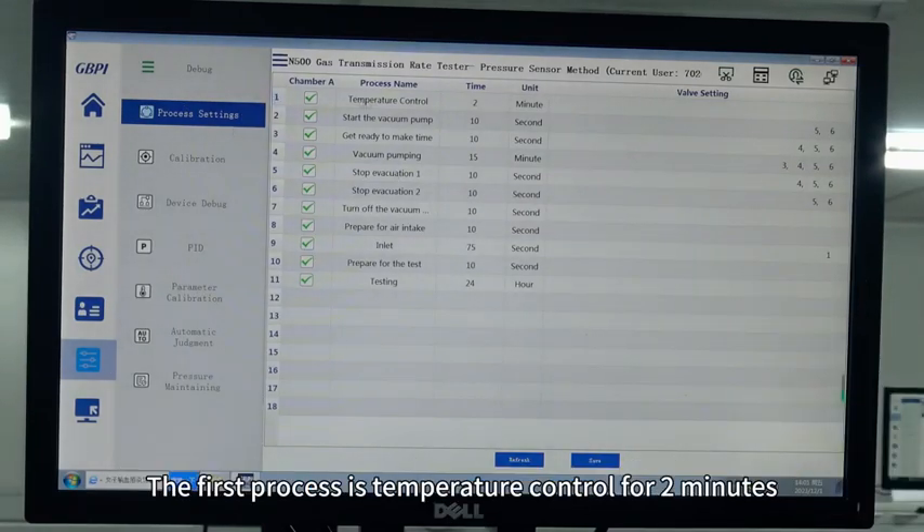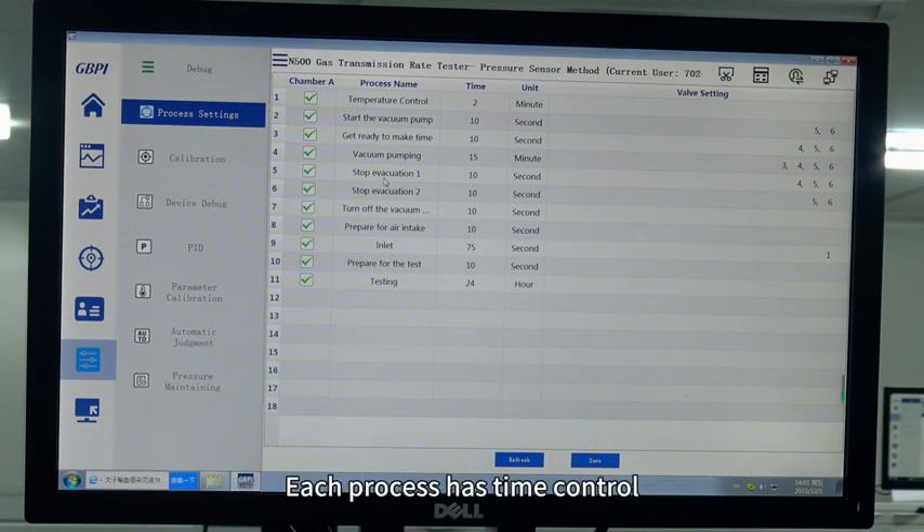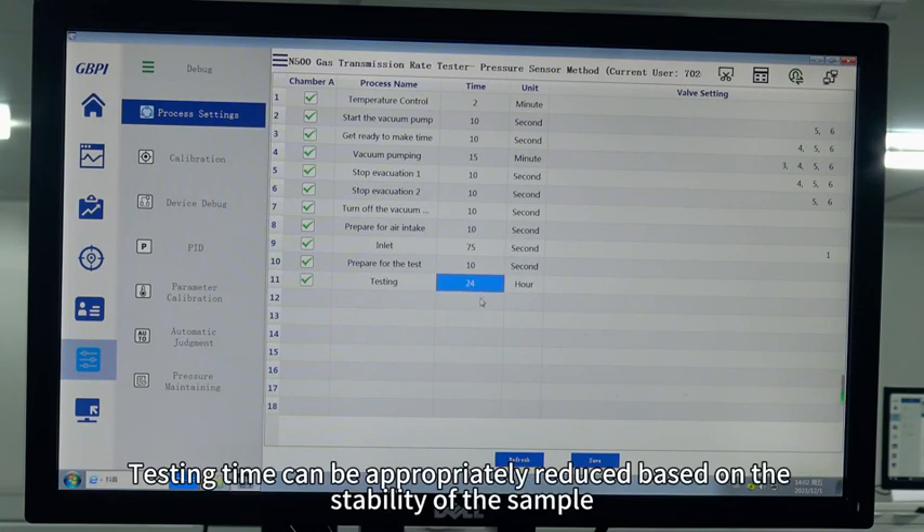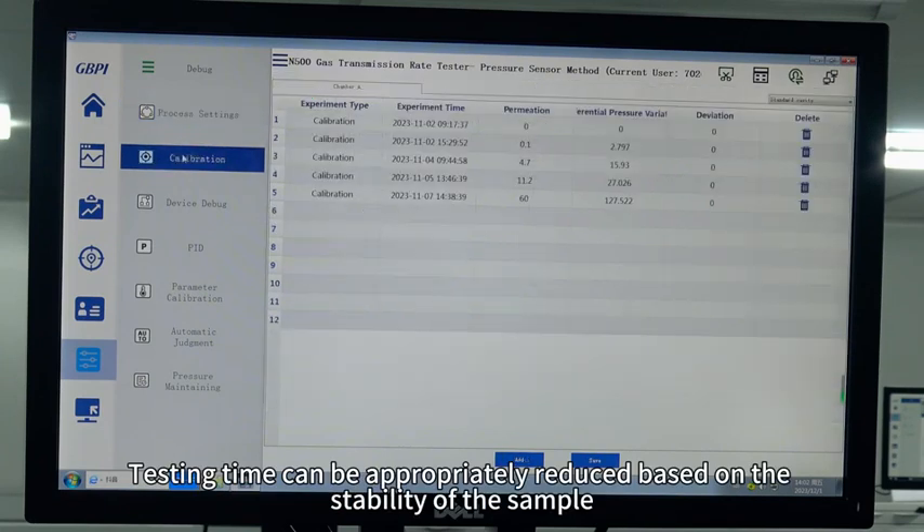The first process is temperature control — temperature control for two minutes. Each process includes: temperature control, vacuum pumping, air intake, and testing. The testing time is currently set to 24 hours. Testing time can be appropriately reduced based on the stability of the sample.